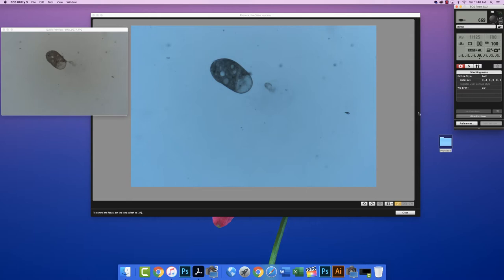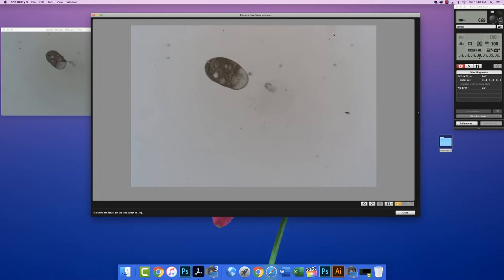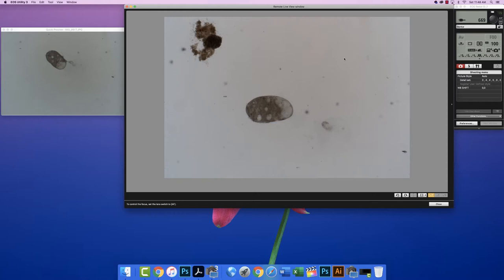I'm going to select the eyedropper, make sure that this is checked, apply to shot images, and then I'm just going to click on some part of the image that doesn't have a specimen on it. And then I'm going to unclick the eyedropper and close this. Again, we're saving a RAW and a large JPEG, and we're saving both to the card into our folder that we just created called Stentor. Okay, take another shot here.